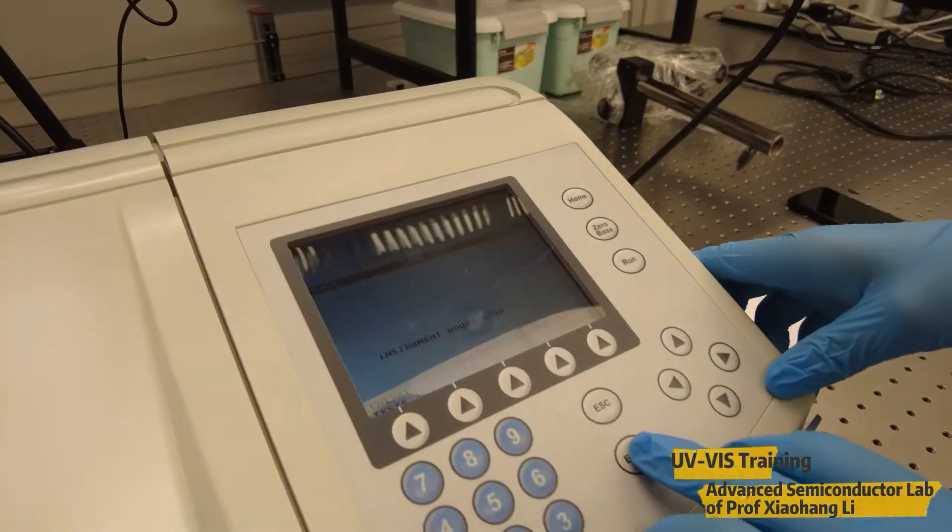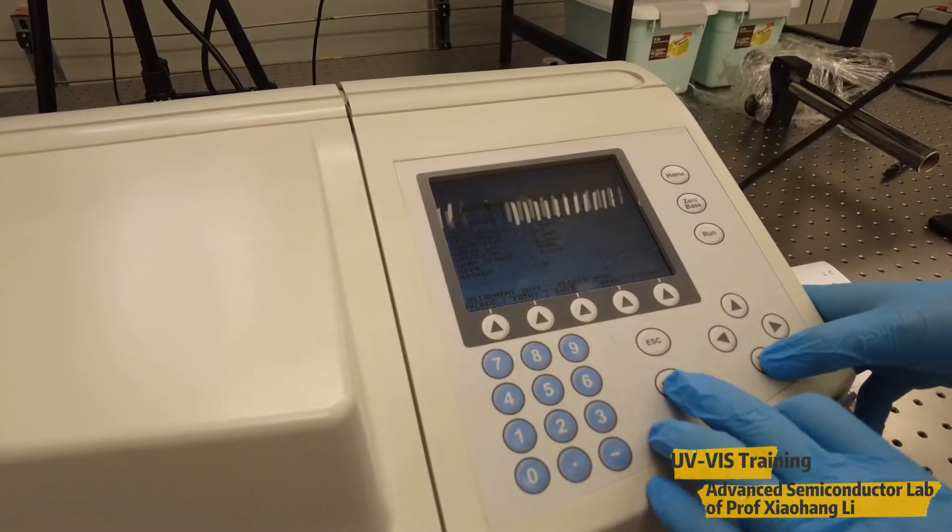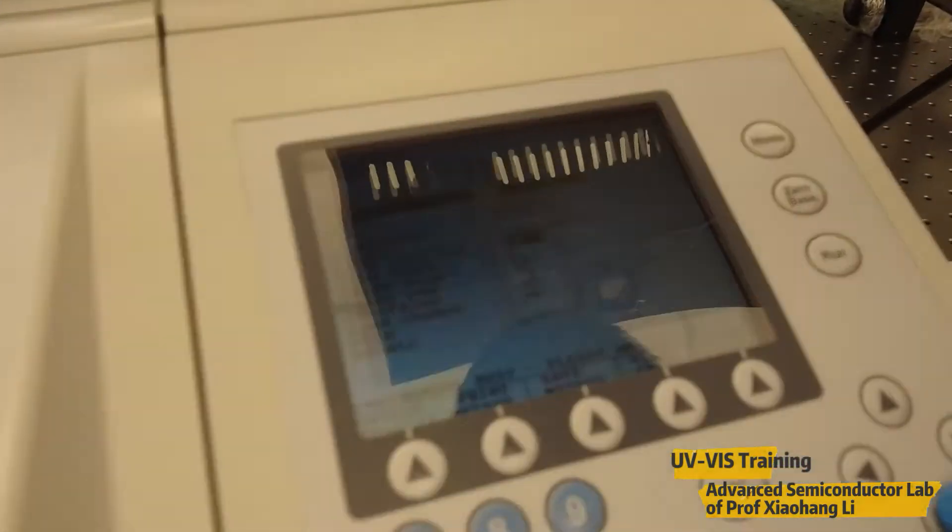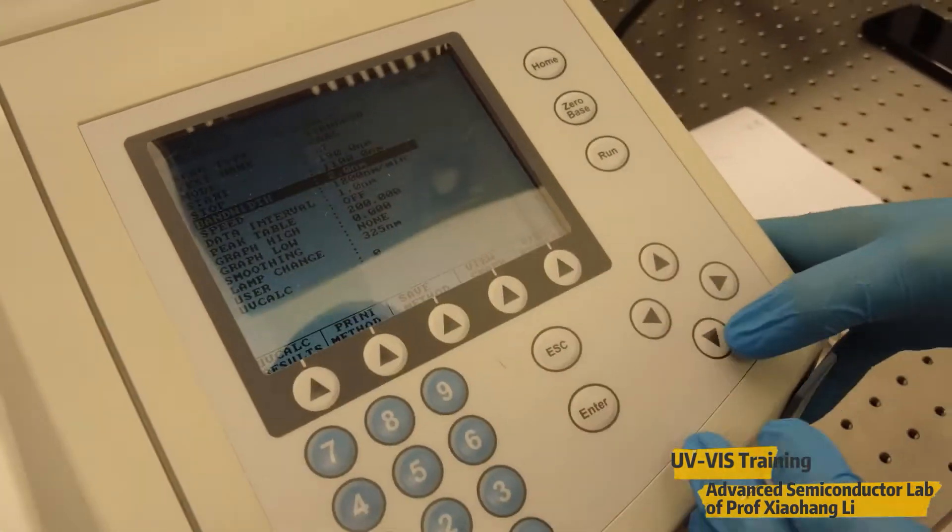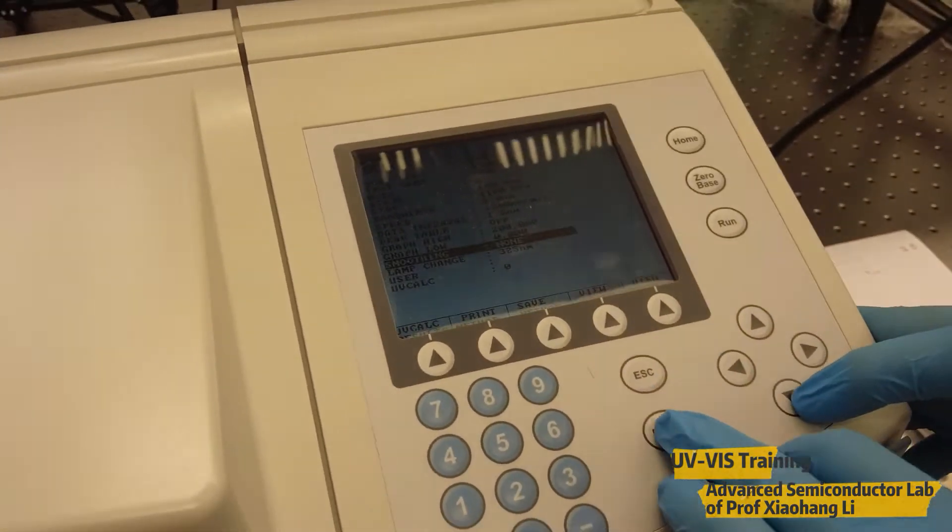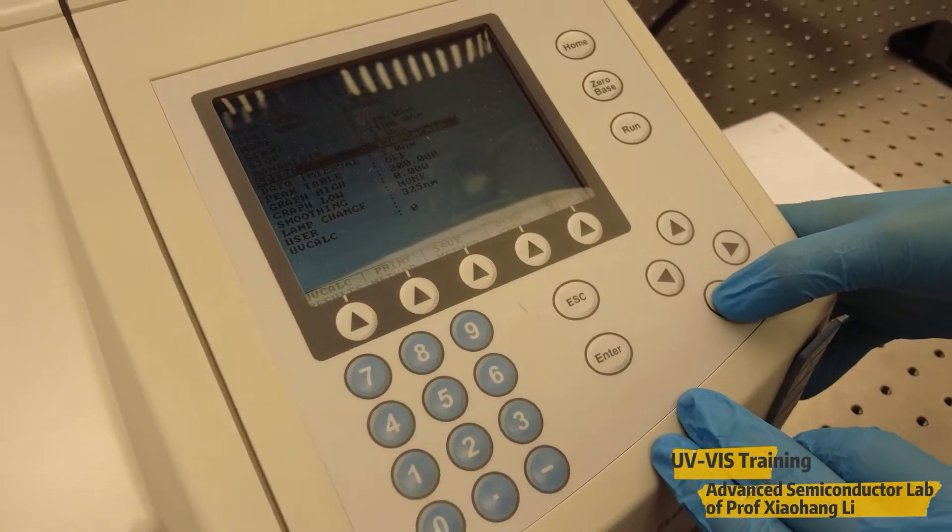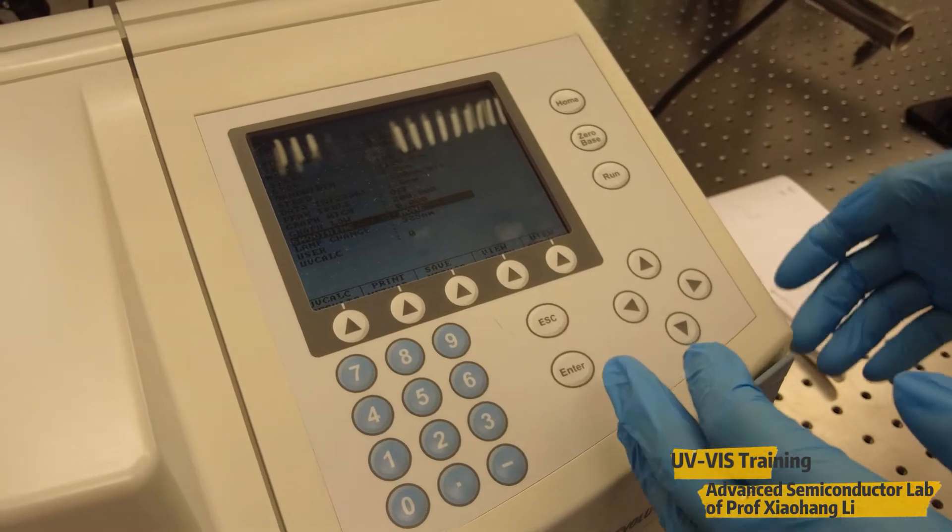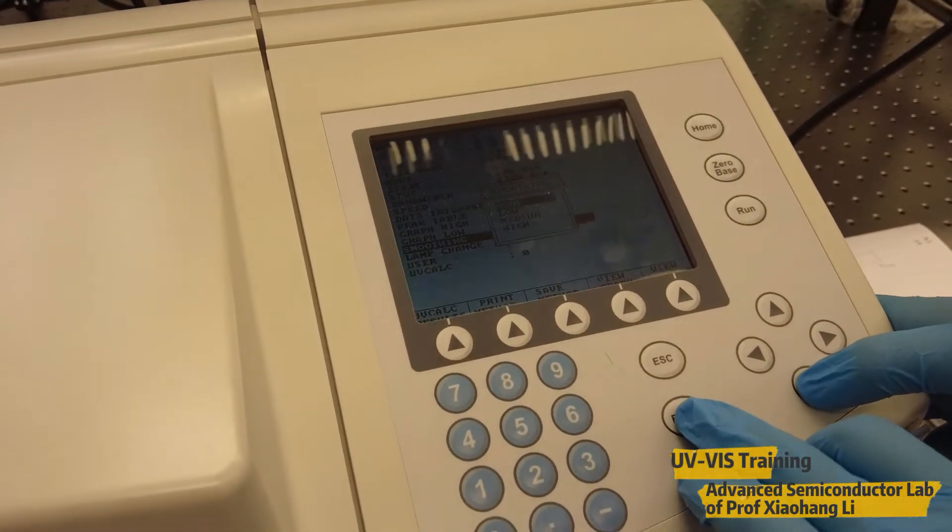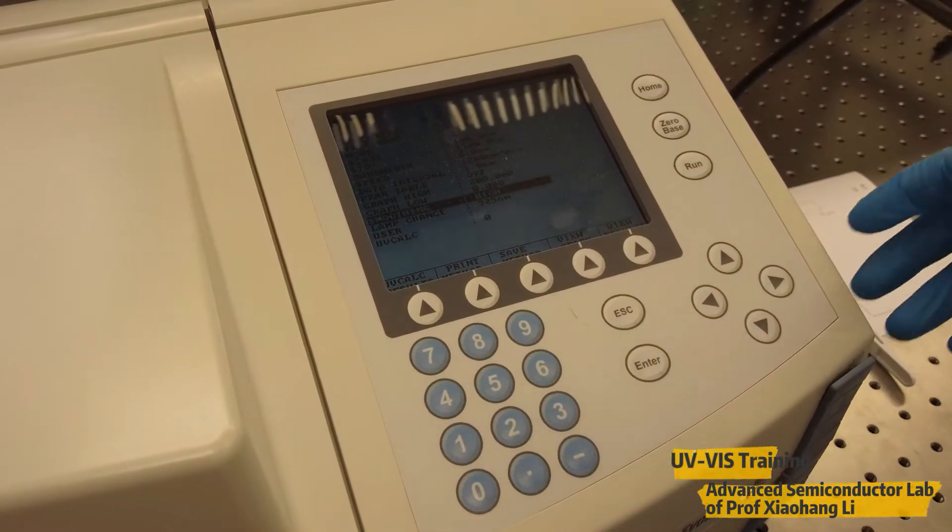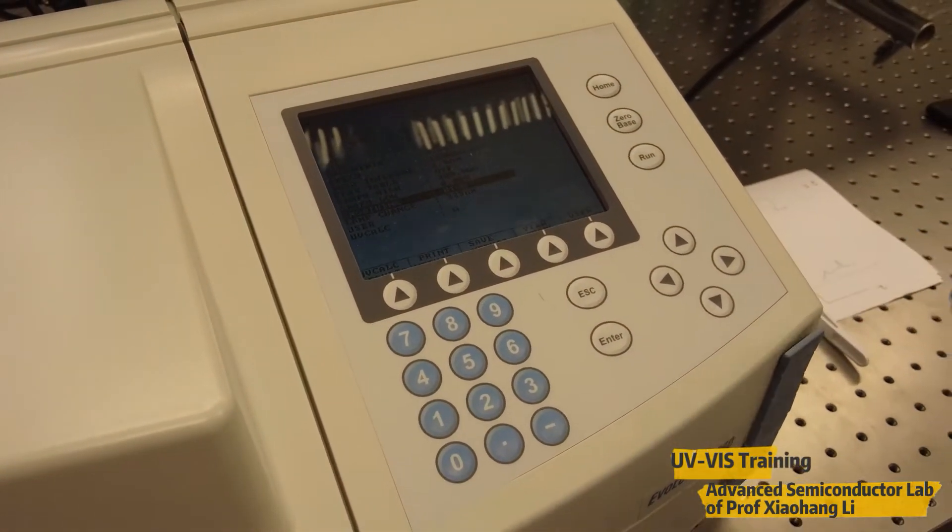By pressing enter we can start the experiment. In the mode we'll choose the transmittance and we can start from minimum 190 nanometer to the maximum 1100 nanometer. For the bandwidth we'll keep it as 2 nanometer and this is scan speed. We will make it as smooth as possible so we'll change the smoothing from low to high.